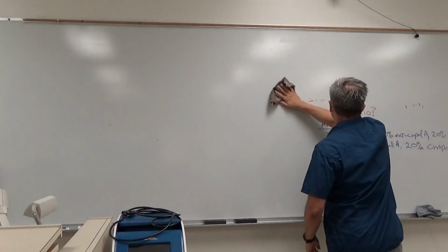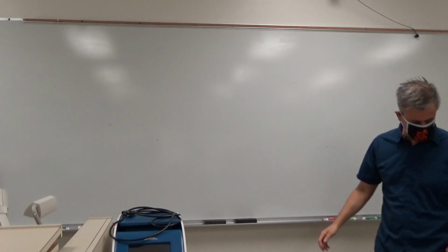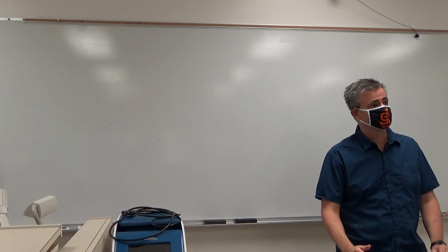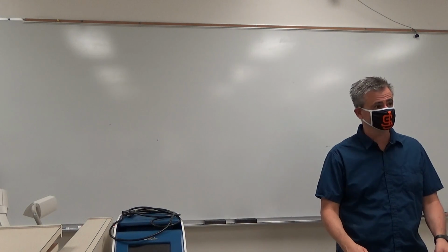Now, got to figure out, let's see, I got a couple more things we got to figure out. What am I going to talk about? Okay, so how are we going to figure out the percent EE? Well, it turns out we can get that directly from optical rotation.